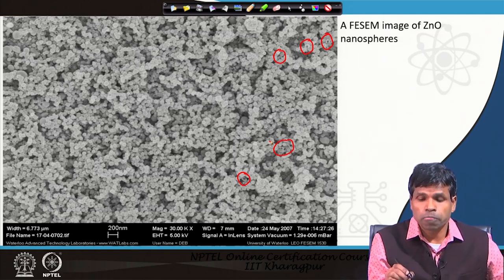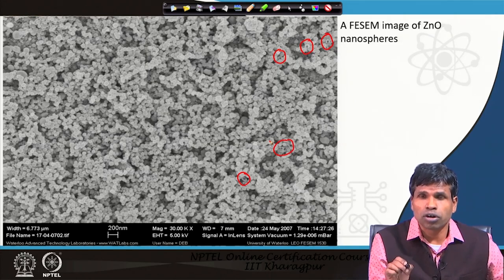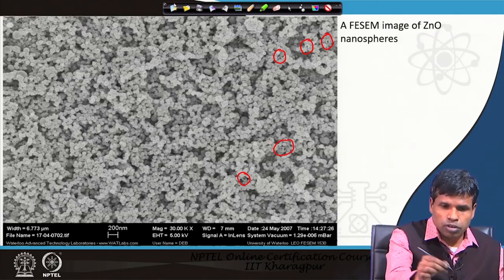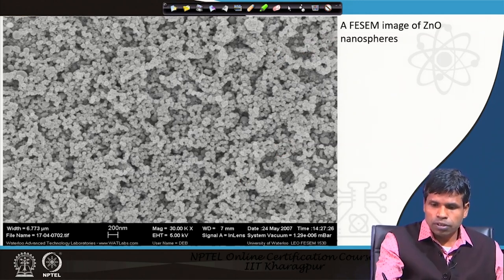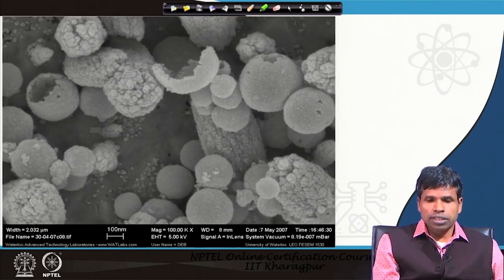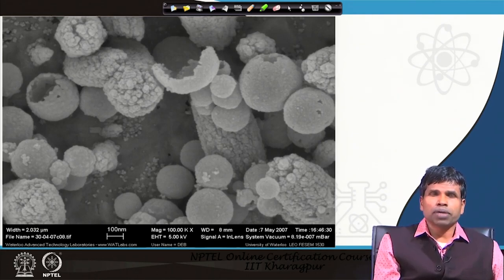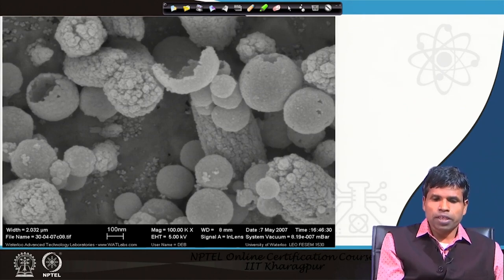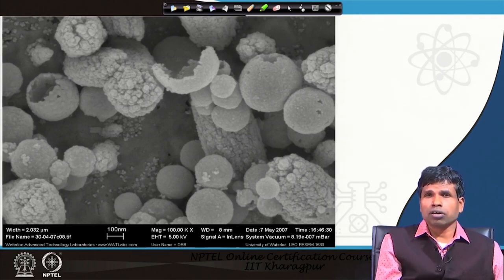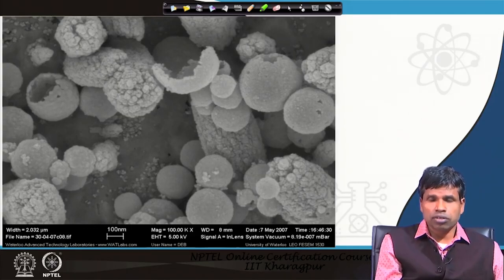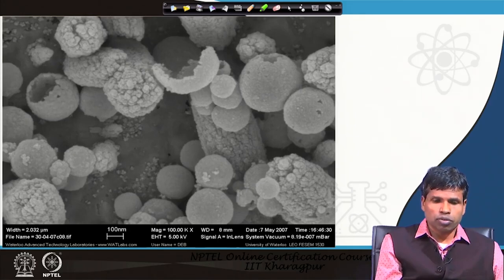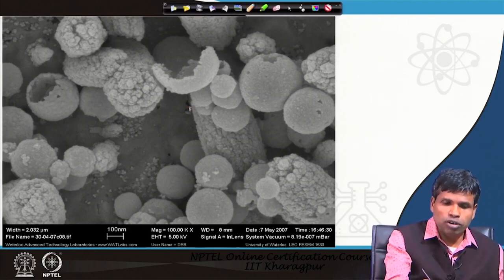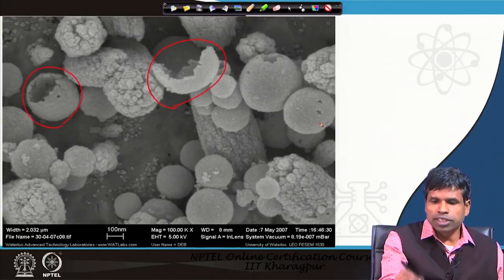This hollowness can only be known when the spheres are broken — if not broken, you would not be able to tell whether they are hollow or solid, because in SEM we see a three-dimensional image of the surface features. To prove these are hollow in nature, here is another higher-magnification image from a different location at the edge of the sample, showing non-uniform growth. The broken spheres clearly indicate their hollow nature — they are completely hollow.